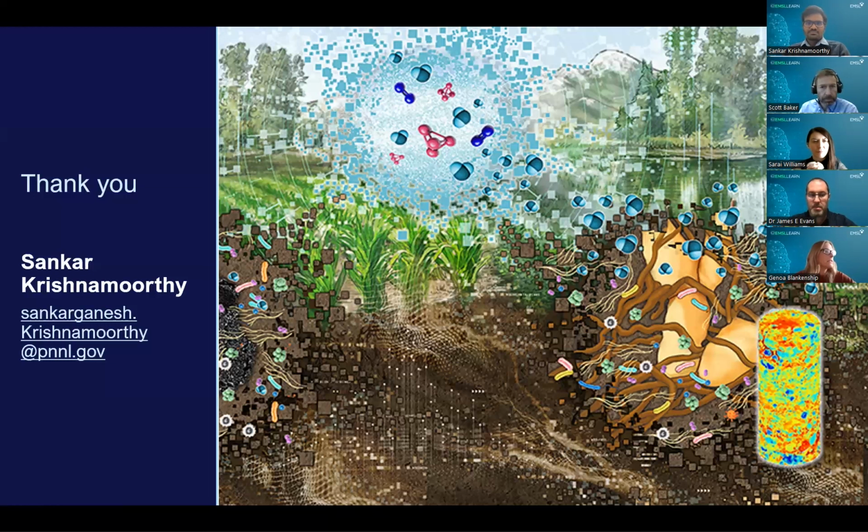Okay, let's see here. Sankar asks, do organisms survive the probe processing when you isolate using FACS? All right, so that's a good question. I think the second half of Ann Summers' question also involves labeling. It depends on the probe type and the organism that we're working with. But we can actually design probes that do not toxically affect the organism.